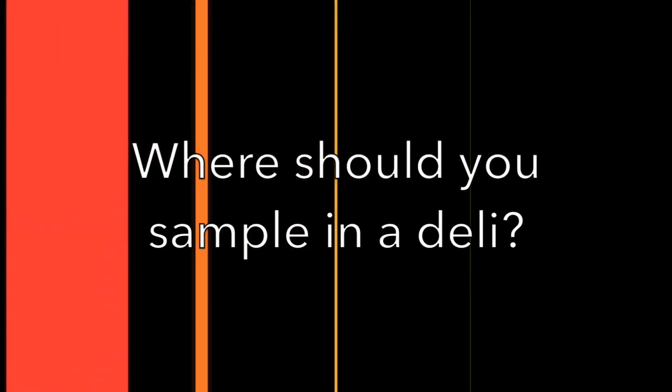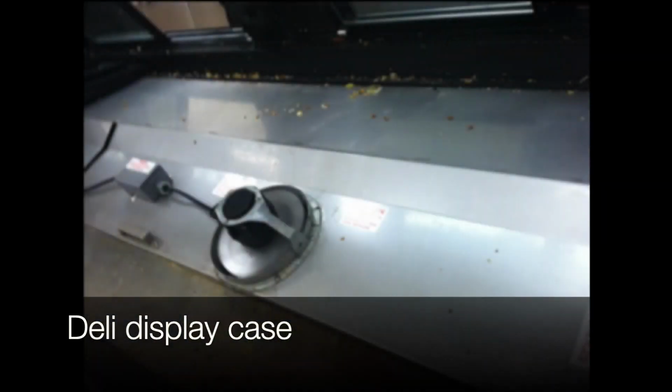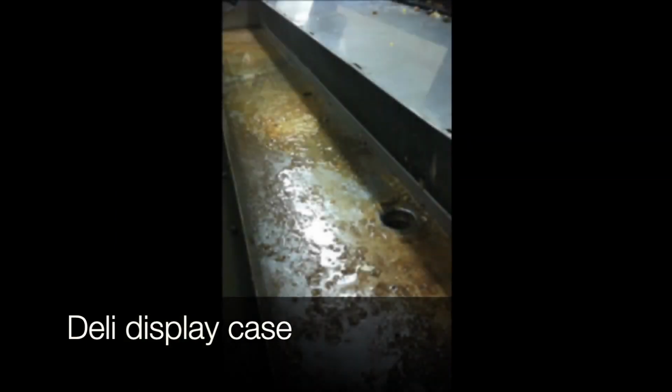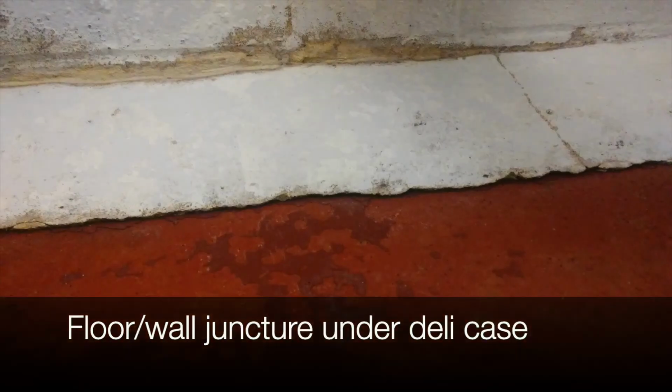Here are some suggestions. Deli display case. Take a close look at deli display cases because they are rarely disassembled completely. You may need to disassemble these to sample them. Ask facility personnel to help you. Ideally, ask for disassembly down to the coils and sample while the deli case is being disassembled. Check out cooling fans and drains in the deli case too.